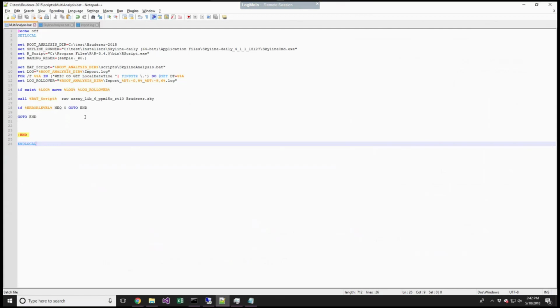If you have enough space on your computer, you can come get what? No, it's not on there. The raw data is much bigger. These files are like 4 gigs a piece. So, yeah, you think about it, 24 of those, you got about 100 gig. So it's about an extra 100 gig. If you've got it, I can help. I can give it to you.